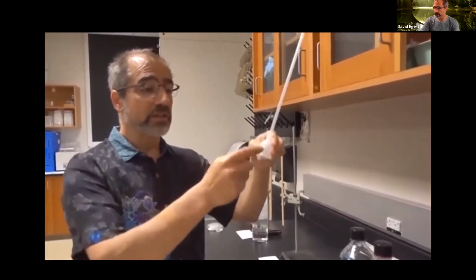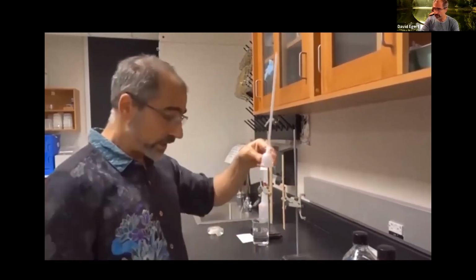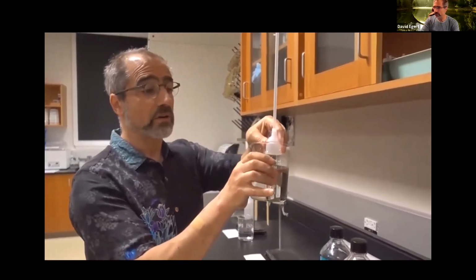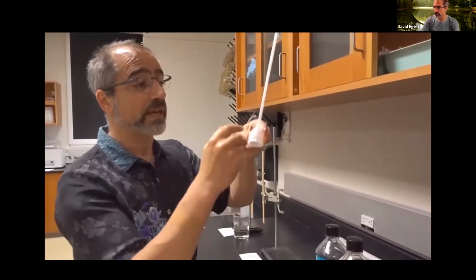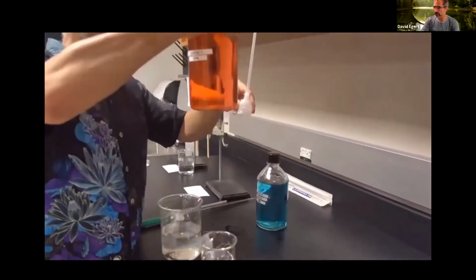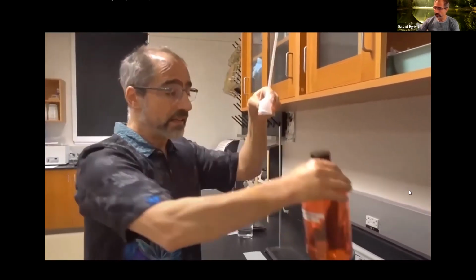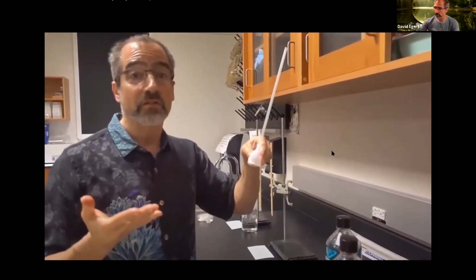one solution inside the tube on one side of this membrane. Then we're going to take this whole thing and put it in a beaker of water. So we're going to have distilled water on the outside of the membrane, and our sugar water inside this little funnel on the inside part of the membrane, which is going to create a situation for osmosis.